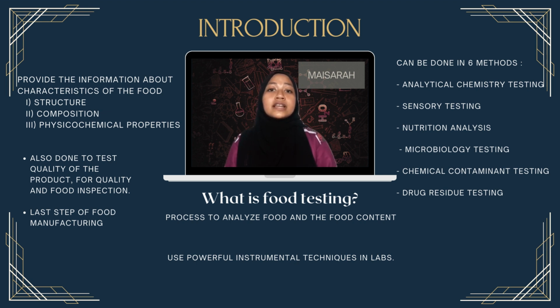This process is the last step of food manufacturing because it is really important to determine the safety of the food. Food testing can be done in 6 methods, such as analytical chemistry testing, sensory testing, nutrition analysis, microbiology testing, chemical contaminant testing, and the last one is drug residue testing.